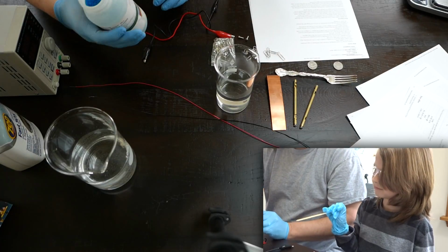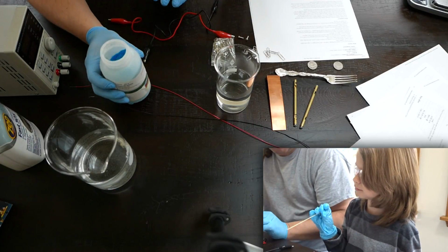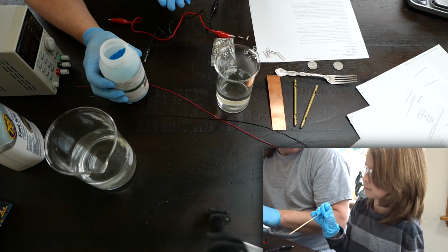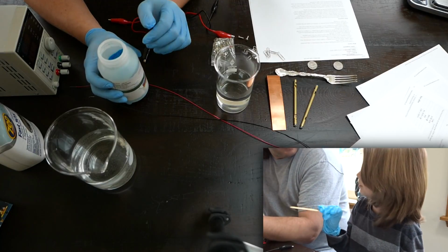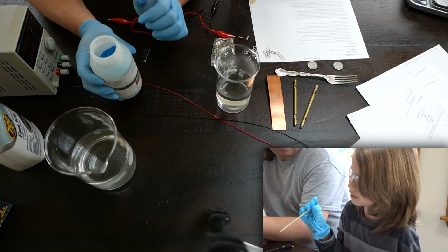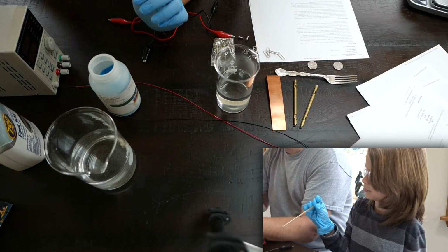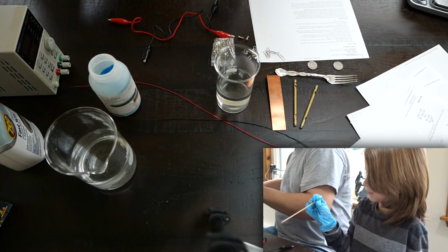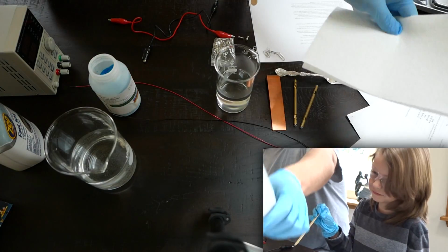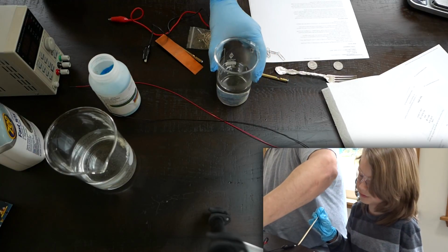All right, so it says to dissolve as much as possible. So what's gonna happen is I'm gonna pour some in there. You're gonna mix it. I'm gonna tell you to stop. I'm gonna pour more in. You're gonna mix it. Okay. Just like when you're making the slime. I don't want to accidentally pour anything on you. So when I say stop, stop. You did that with the slime. I know. It's still fine if you do it. But I still have to wash my hands or something after.